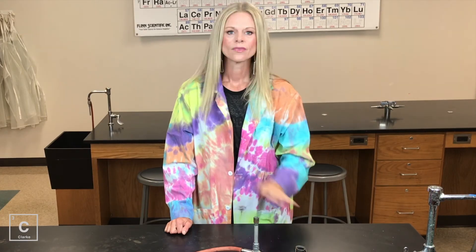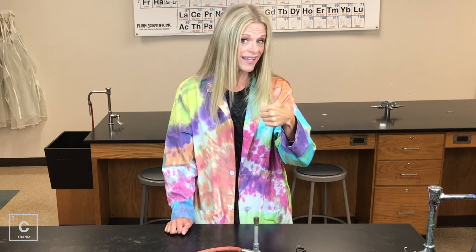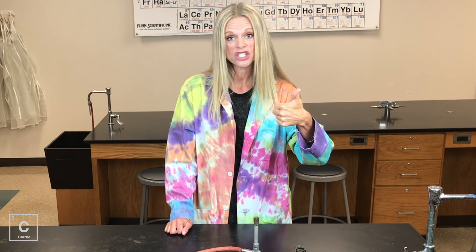That match in the flame — that was pretty cool, right? Who knew that a flame had different temperatures throughout? Now you know where the hottest part of the flame is. We will always use that roaring blue flame in chemistry, and whenever you're going to heat things up, you're going to use that hottest part of the flame. You will use that every single time you light a Bunsen burner from now until the end of class. Stay tuned — we're moving on to other techniques, like using temperature change to see if a chemical reaction is occurring. Until next time, bye y'all.